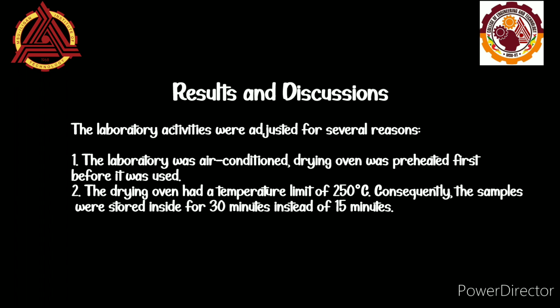The laboratory activities were adjusted for several reasons. Firstly, the laboratory room was air-conditioned, requiring the preheating of the drying oven before its use. Secondly, the drying oven had a temperature limit of only 250 degrees Celsius. Consequently, the samples had to be left inside the oven for 30 minutes instead of the originally stated 15 minutes in the procedure.